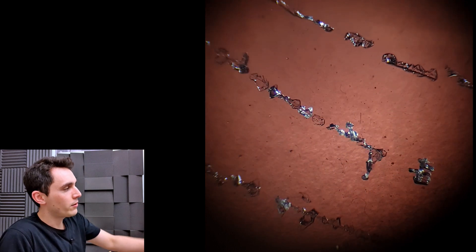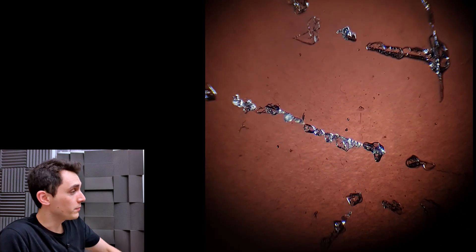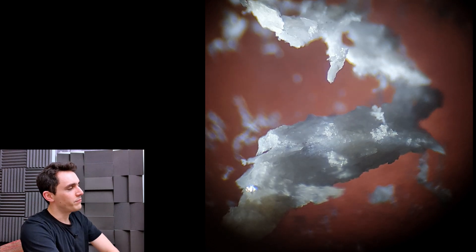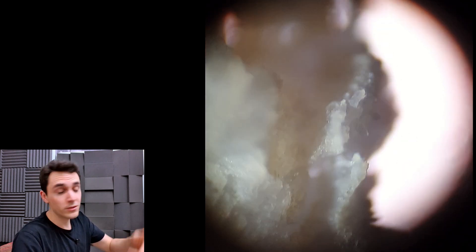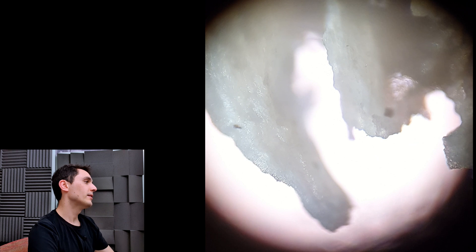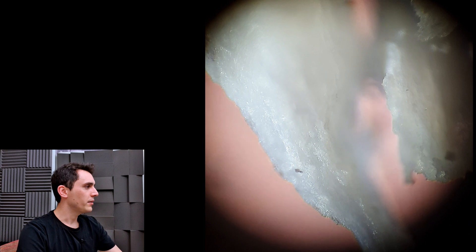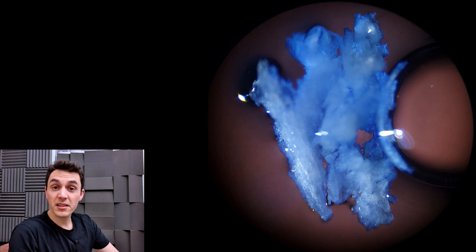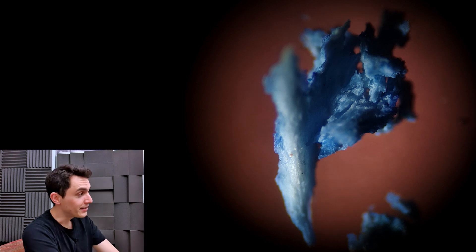These little crystals here are the potassium hydroxide dried on the slide, leaving behind these beautiful crystals. So rather fascinating. This is the piece of bone — and if you're wondering why it looks broken up into segments, I thought I'd be clever and try to fish it out with crocodile forceps, and that just broke it. Unfortunately. But here we're looking at it in standard light field microscopy, and now we're looking at dark field.